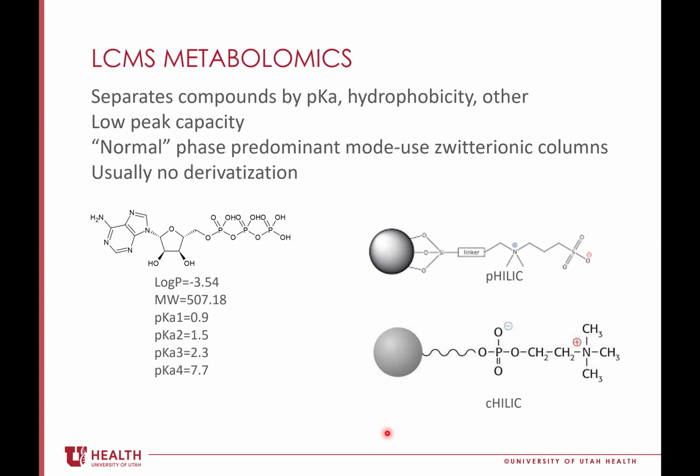And then the other problem, and this is changing a bit and is more technical, is that we're moving from the DDA approach to data independent analysis. That will happen more often, but we're not there yet for the metabolomic side. It's happened on the proteomic side, where there's been a big revolution in proteomics in the past year. Those are coming, but not really from metabolomics yet.